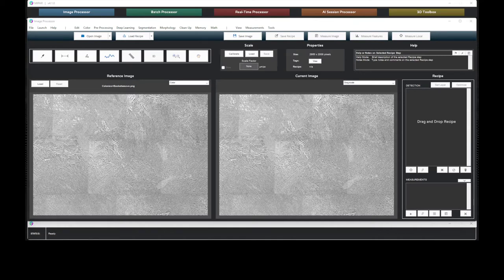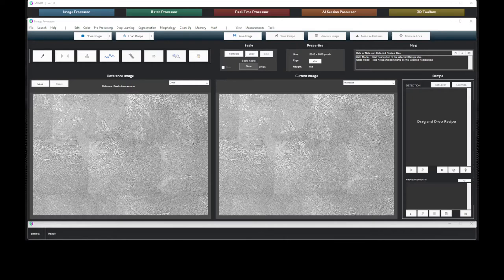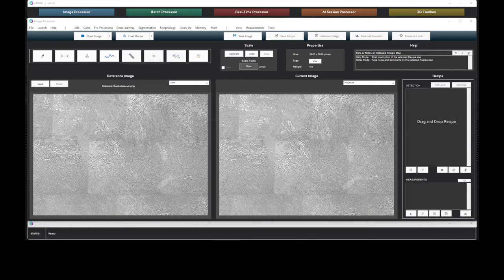In the past, this analysis would be done manually. An operator would annotate the image with the basket weave versus colony microstructures. The manual analysis is prone to error and is extremely time consuming for larger data sets.